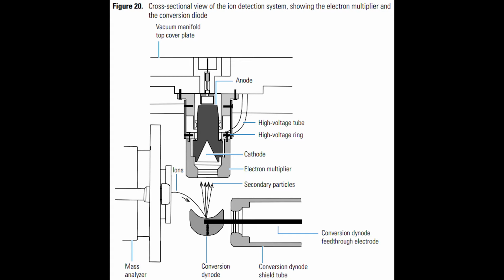Remember, detectors do not sort ions. All they do is convert ions to electrical signal. But if the mass analyzer does its job, we still need to detect these ions. Now, we first introduced these ideas of charge and voltage and detecting frequency, current, and voltage when we talked about GC detectors and the FID. I said, let's hold up a minute and let's talk about actual signal, converting our chemistry to actual signal.